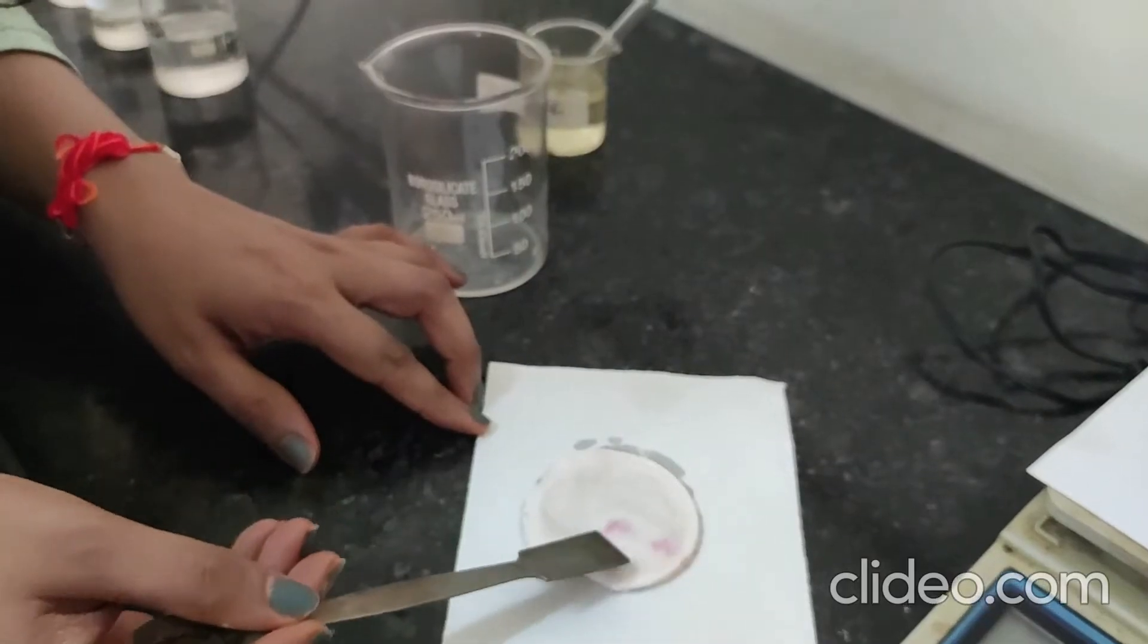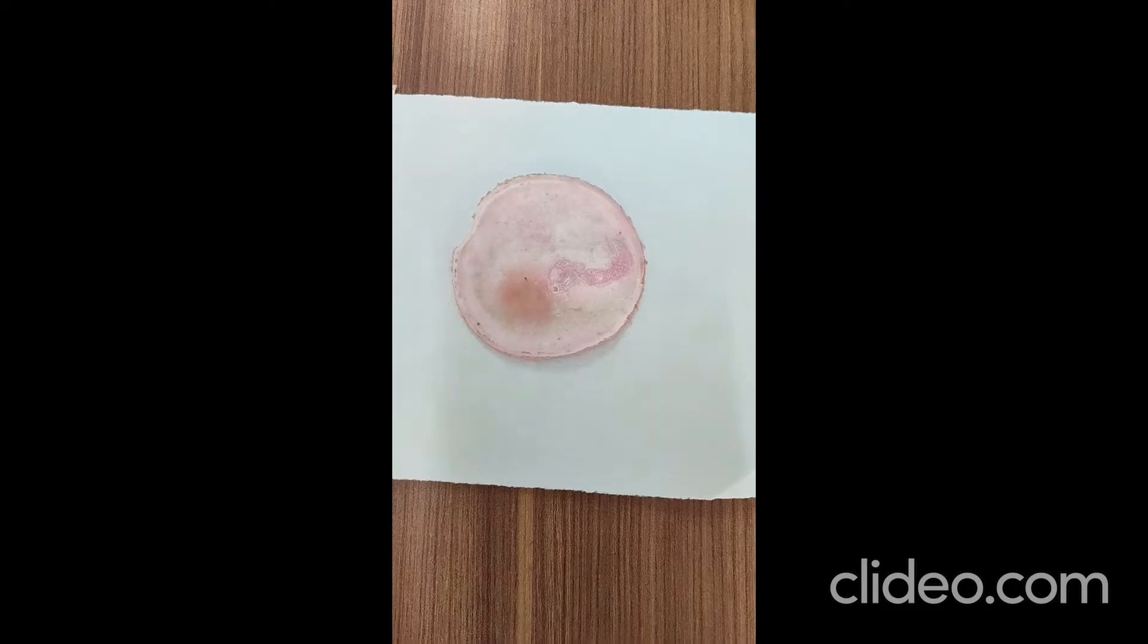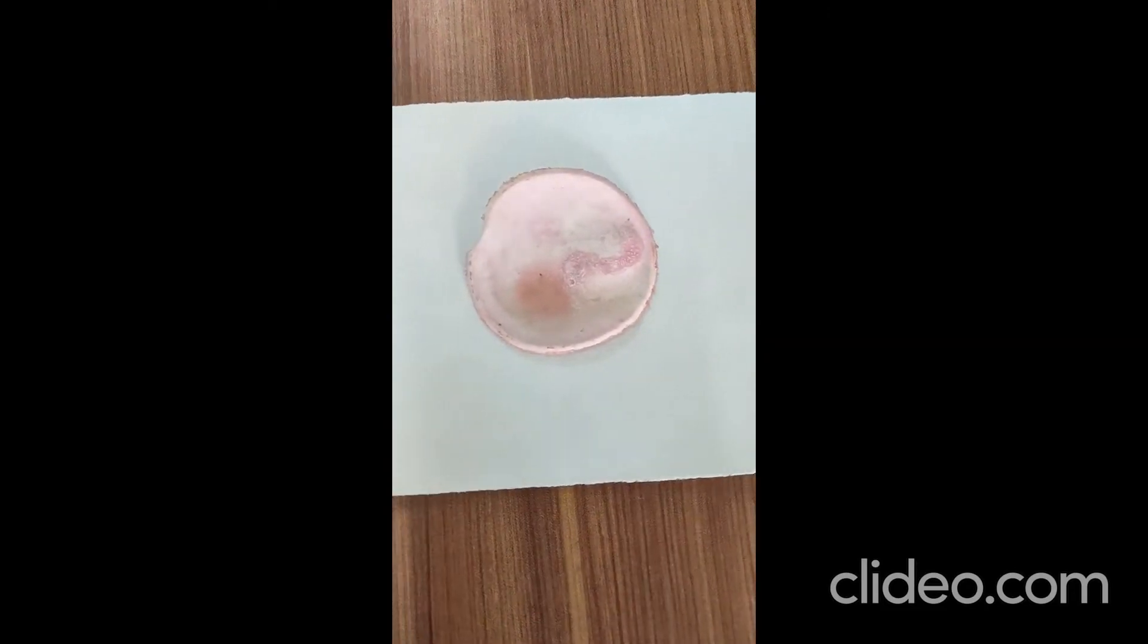Dry the content and note the yield weight. This is the dry bakelite of light pink color.